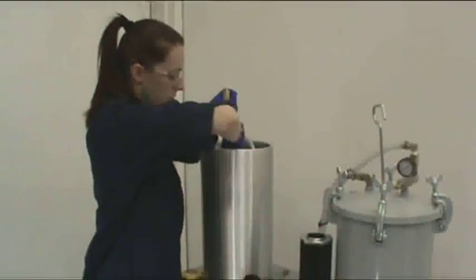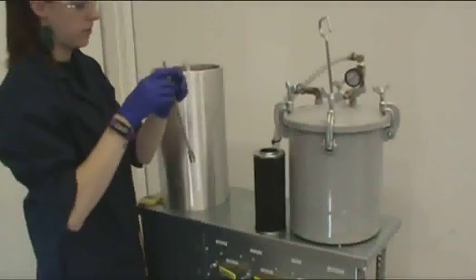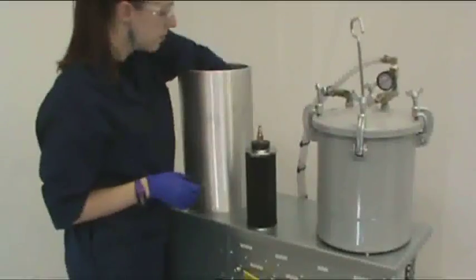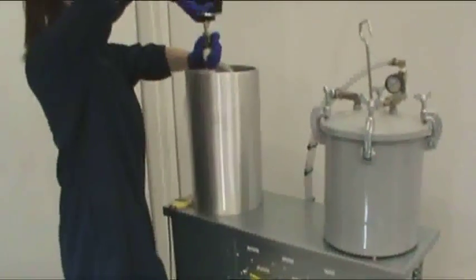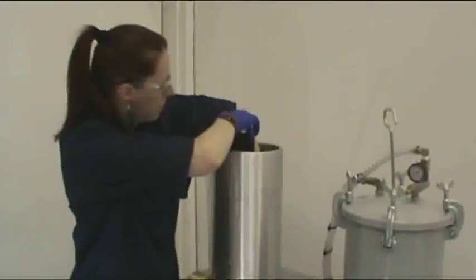The modular design can accommodate more regular filters such as large sized filters and bag or sock filters. This new design works with all new components as well. Filters are now washed using solvent and compressed air, and there are no electrical components, which allows for the use of flammable solvents.